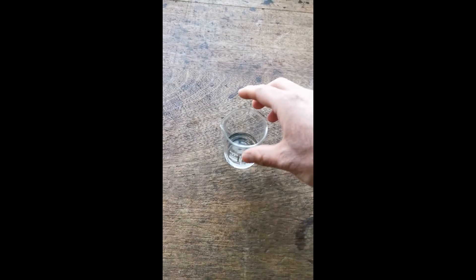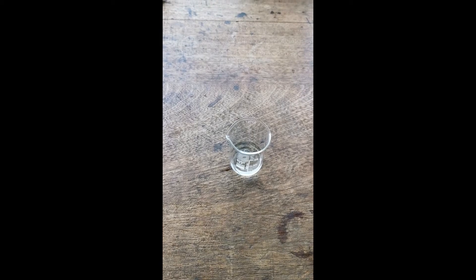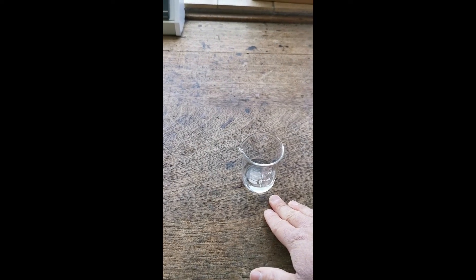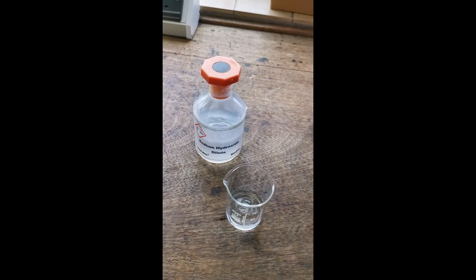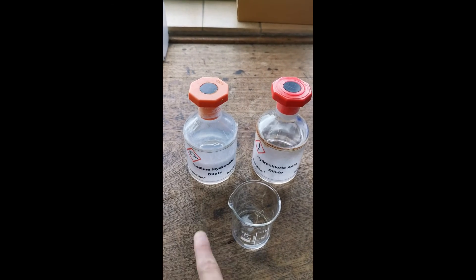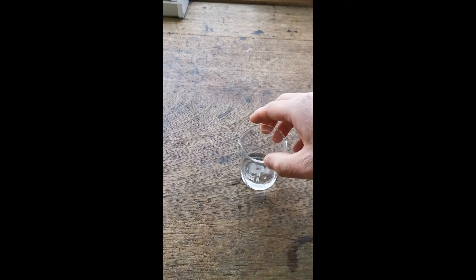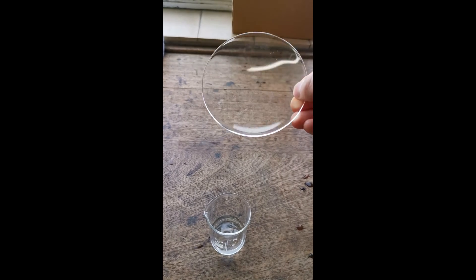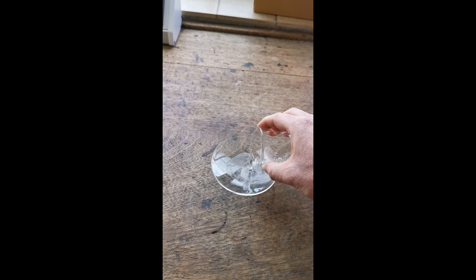Now that we have our acid and alkali mixed together, we want to separate the water in the solution from the salt. Because we're using sodium hydroxide and hydrochloric acid, that salt should be sodium chloride. So we're going to pour the sodium chloride and water mixture into a watch glass, which looks like a big contact lens but is made of glass. We're going to carefully pour this into the watch glass.